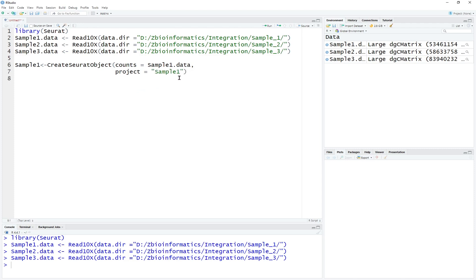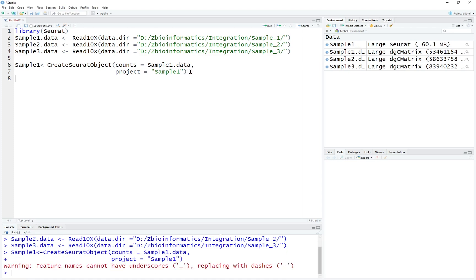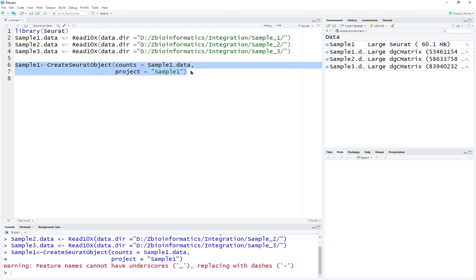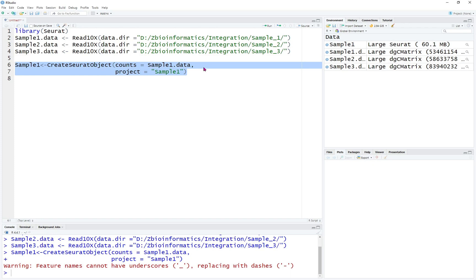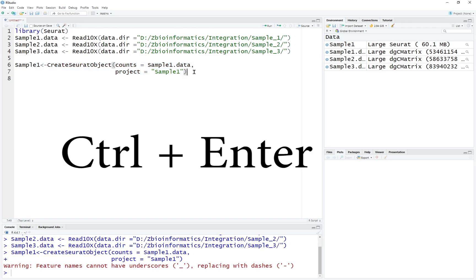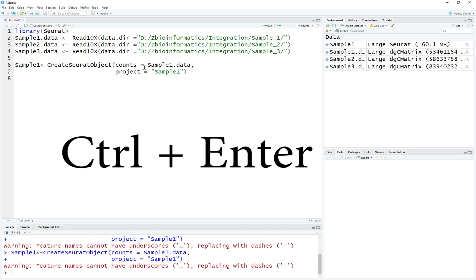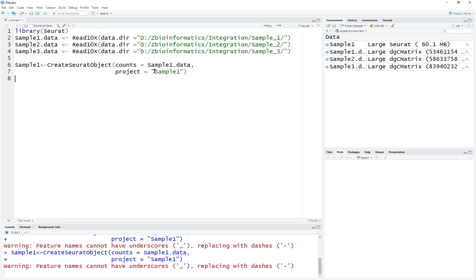And we're going to name this project — the project is going to equal to sample 1. If you don't know how to execute the command, you can select the line or put your mouse cursor anywhere on the line and press Ctrl and Enter at the same time. It will execute the command, or you can simply click Run — they do the same thing.